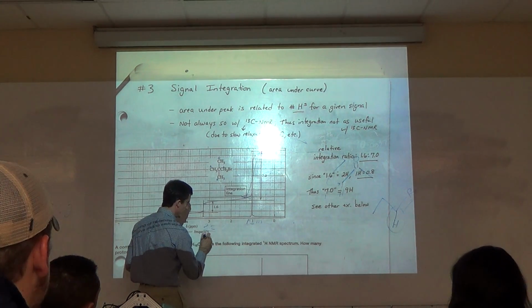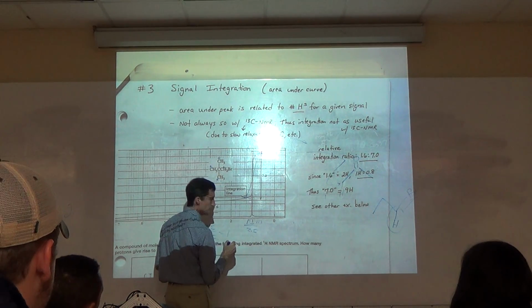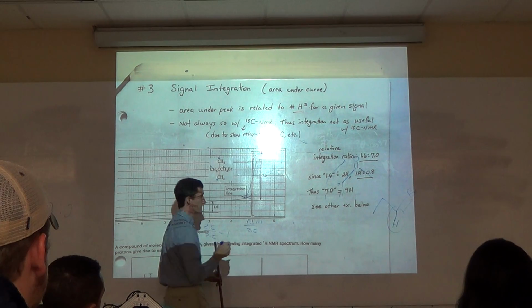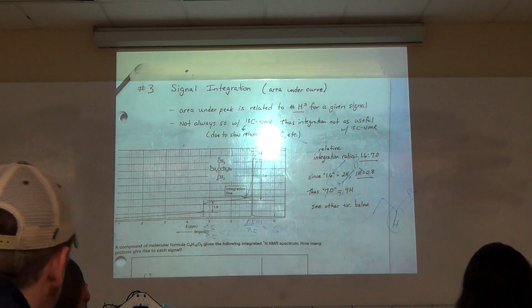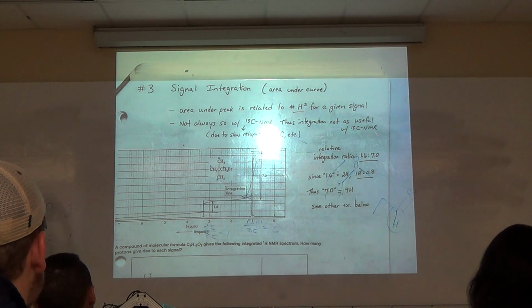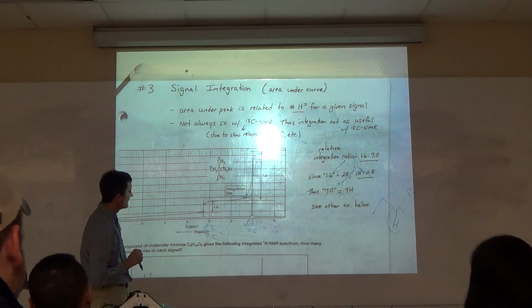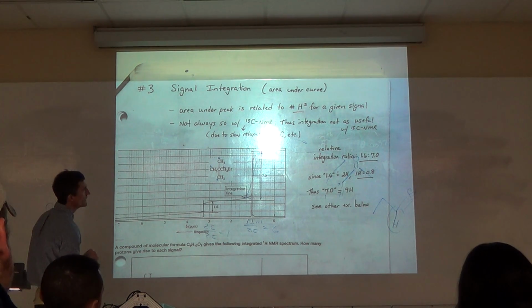Let's turn this into 1 by dividing by 2.5 equals 1. Divide that by 2.5, what do we get? 6? Yeah, 6, right? So it's a 1 to 6 ratio. What is this ratio? It's not 1 to 6, it's 1 to 4.5. I don't know if we measured this yesterday or what.